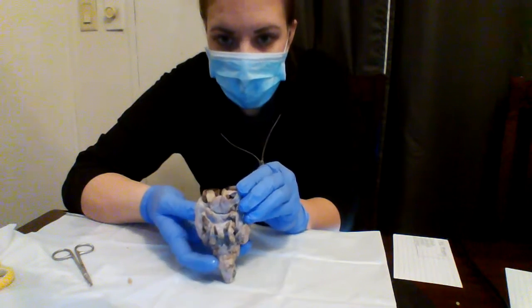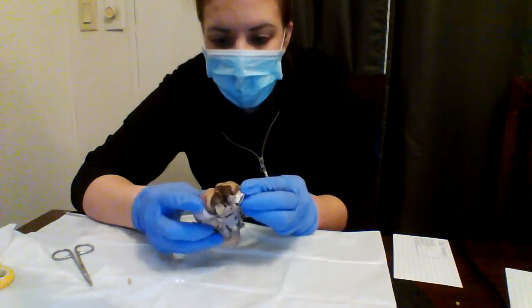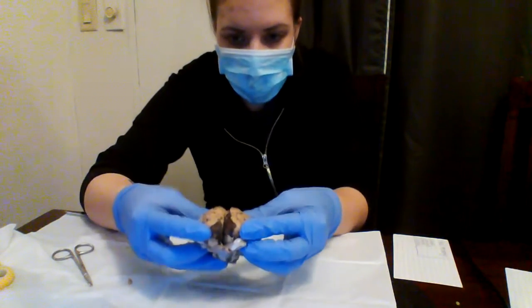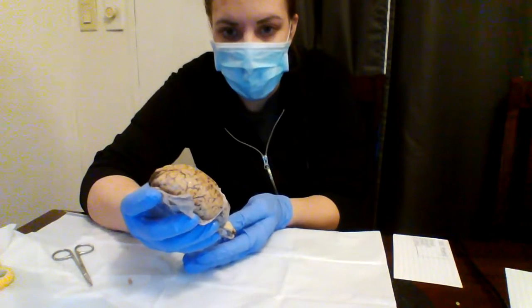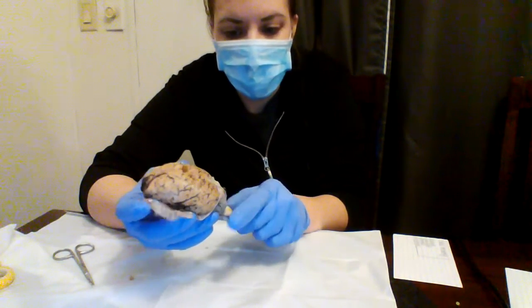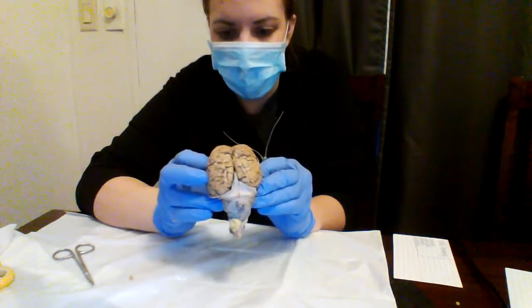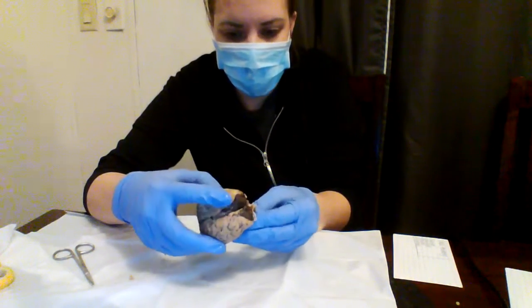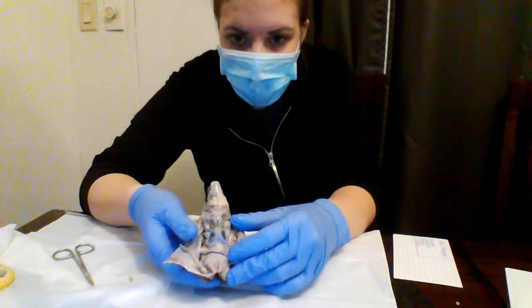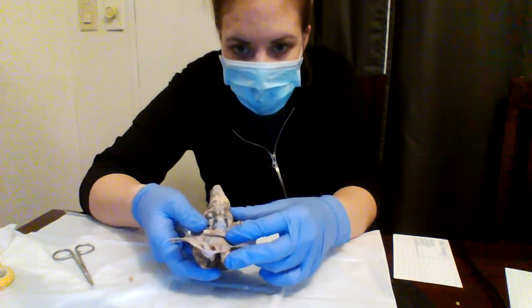Turning it this way, you can see more of the structure of it. I know it's really hard to see on the video. Oh, those were the things that were above the optic nerve. So technically the brain would be sitting like this. So this is going to connect to the spine. This is just the basic shape of it, going over everything. You can really see here, this part is what I was telling you about, the optic. You can kind of feel it right there.